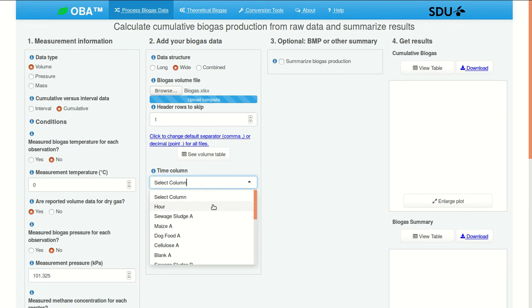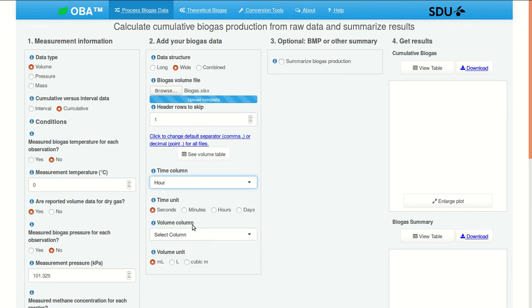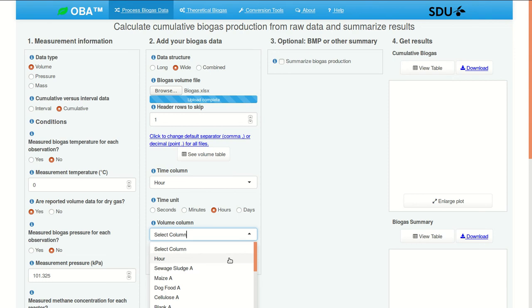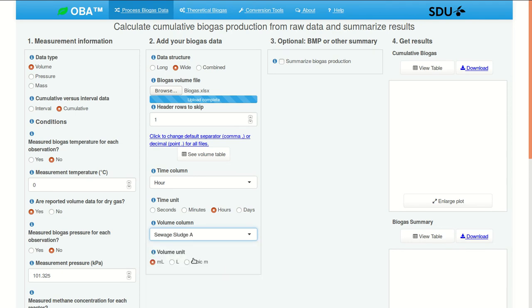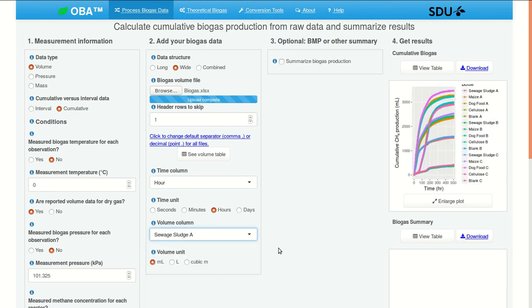Our time column is called hour. Time unit is hours. Volume column. Here it's the first volume column. And then all the rest will also be assumed to be volume columns. And units, milliliters.